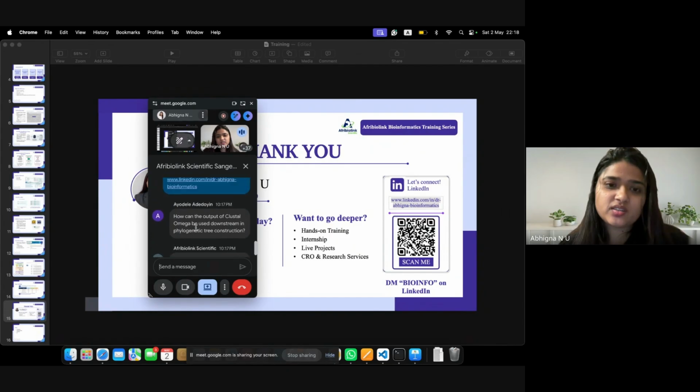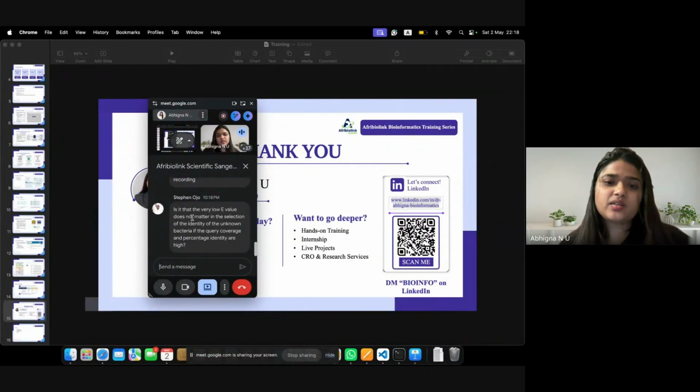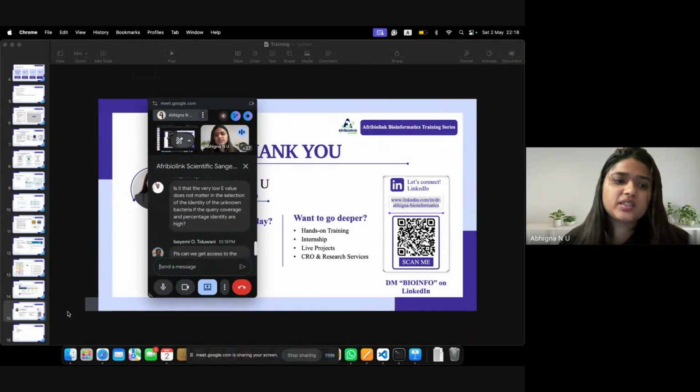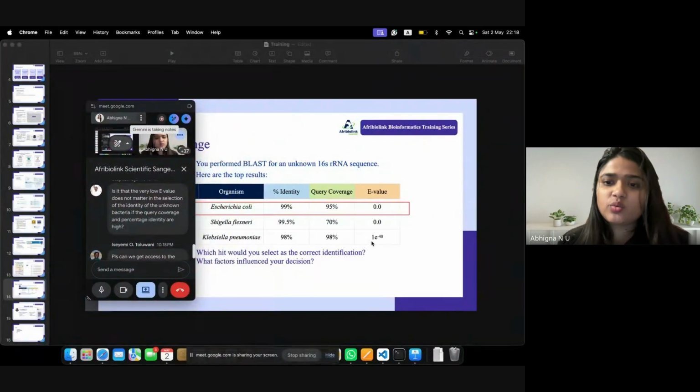Any questions? Is it that a very low e-value doesn't matter in the selection? See, you need to look at all three.